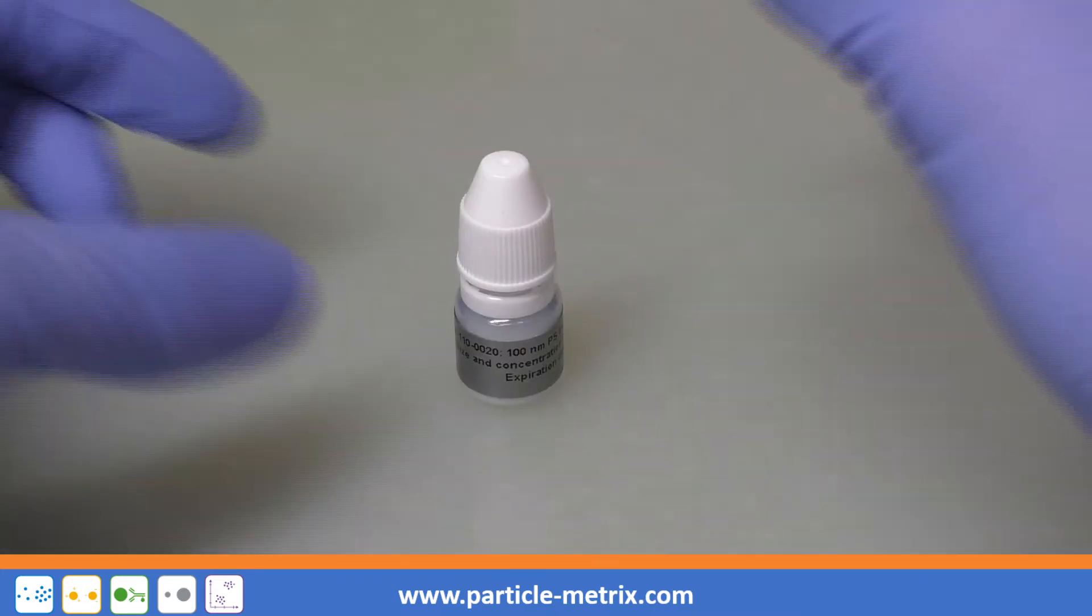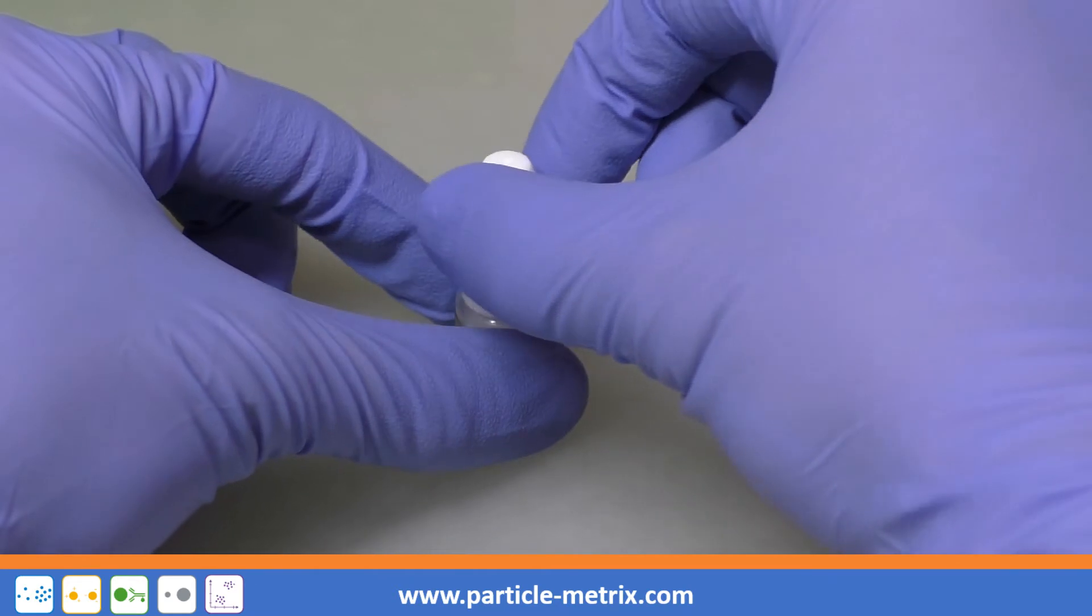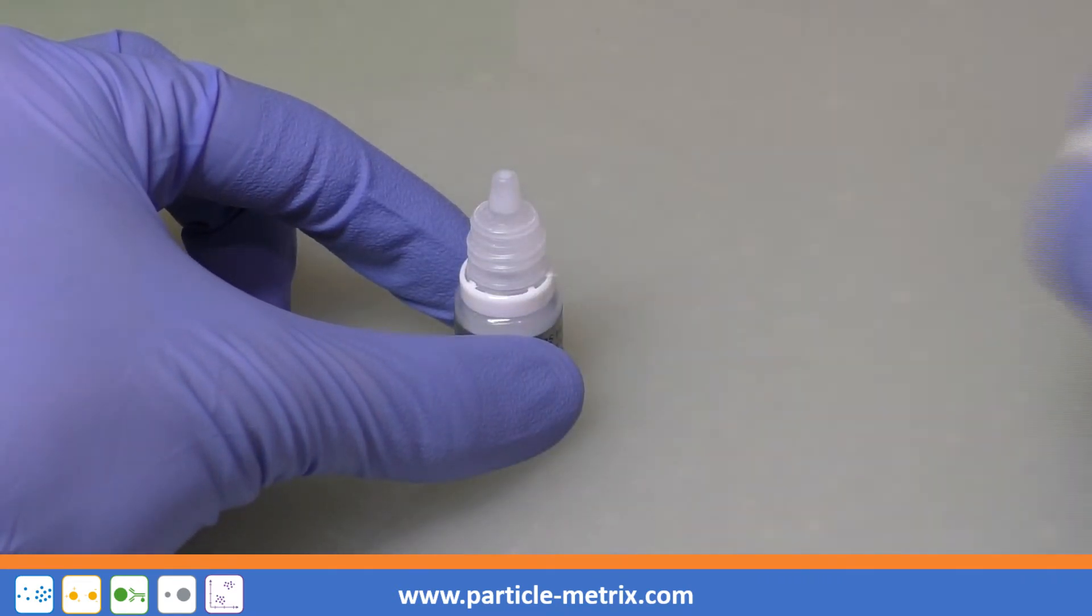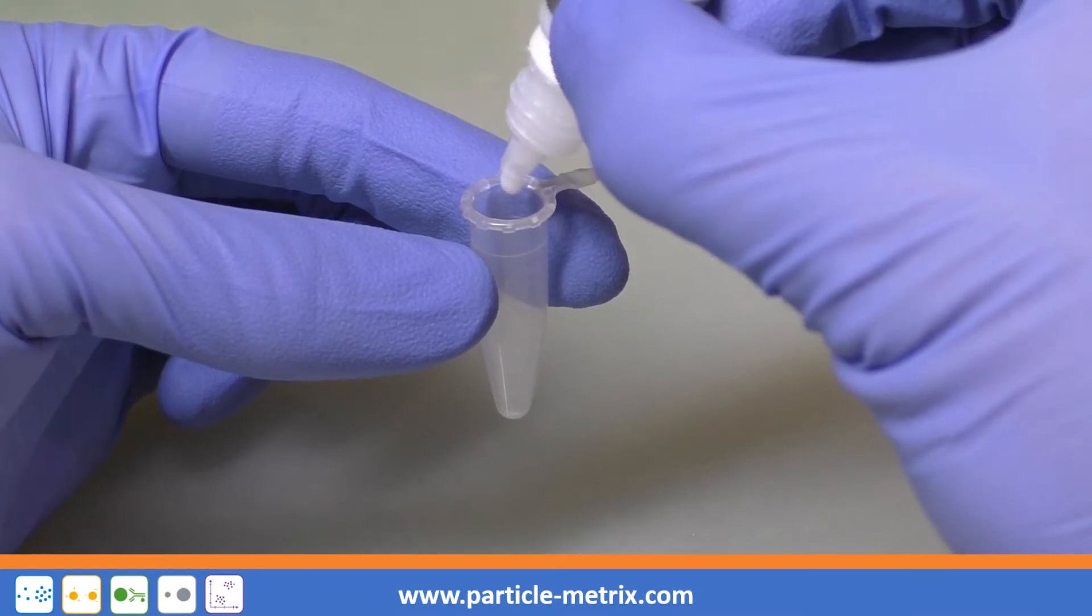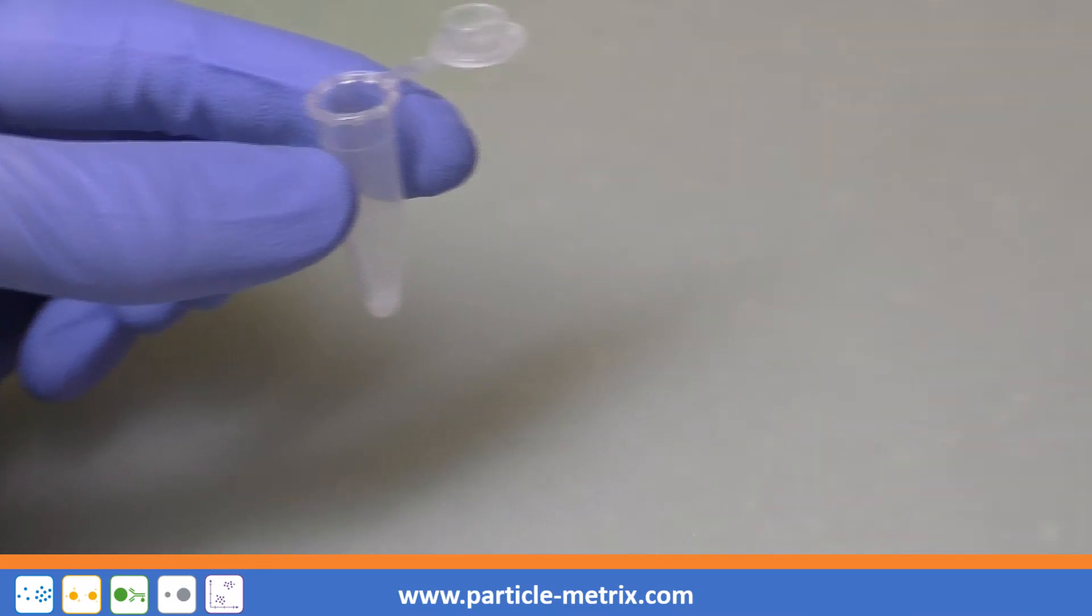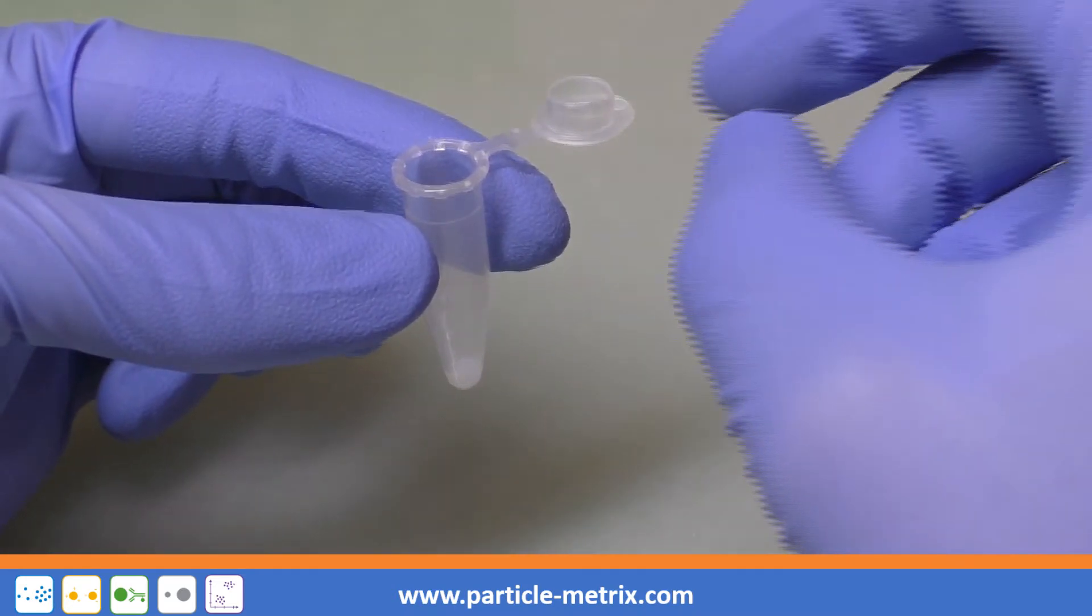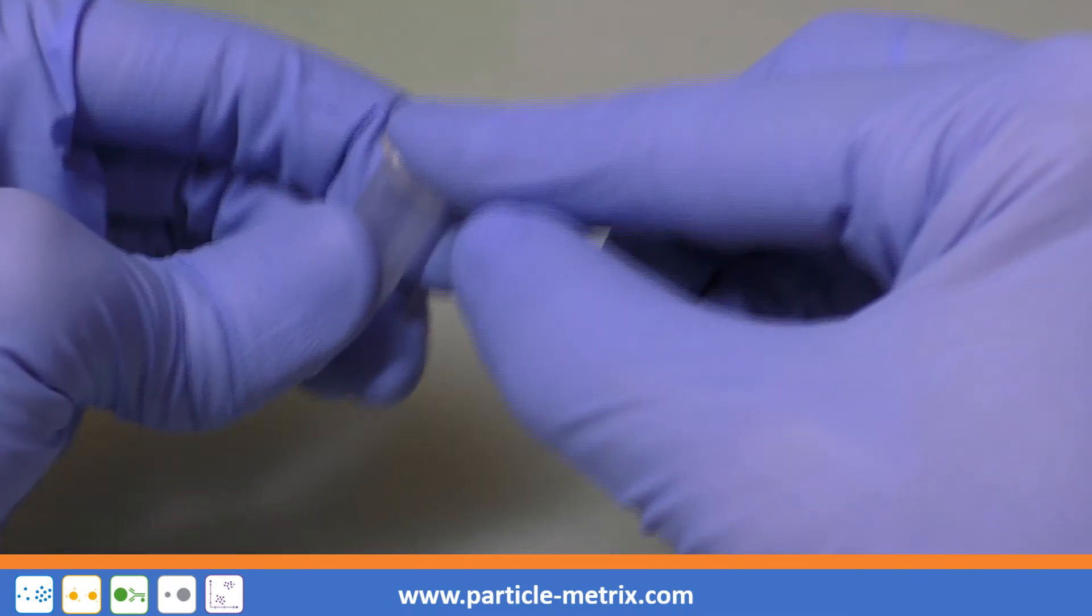The 100 nm polystyrene particles are supplied as a concentrated solution in a dropper bottle. To maintain the stability and sterility of the standard solution, first put a drop of the original solution in a suitable reaction tube.